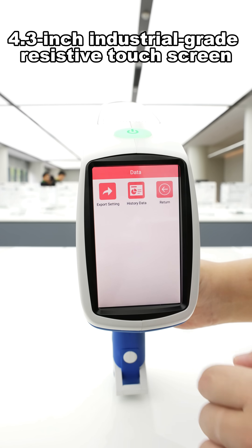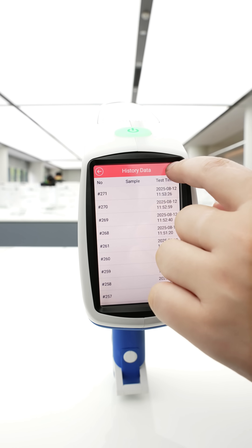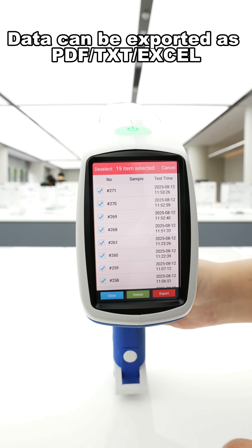4.3-inch industrial-grade resistive touchscreen. Data can be exported as PDF, TXT, or Excel.